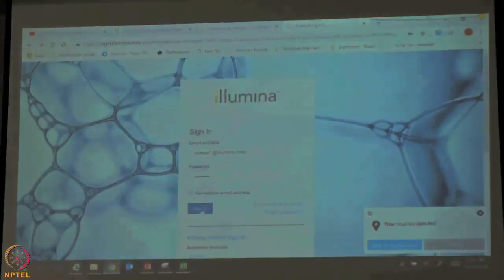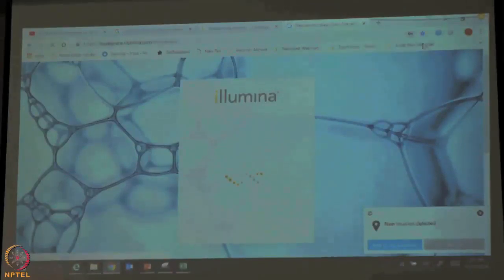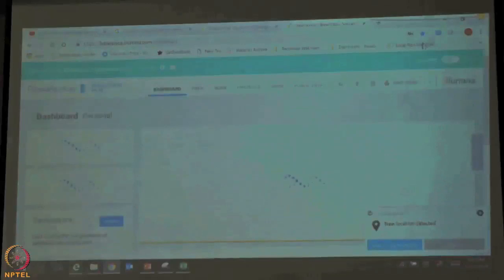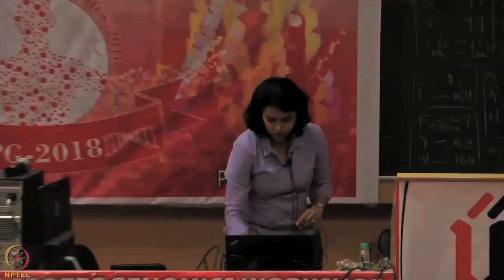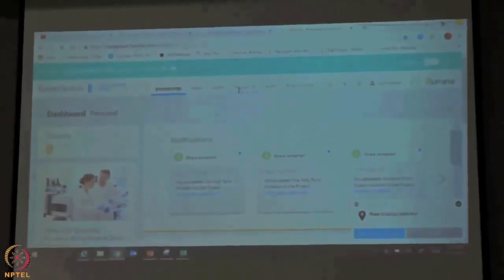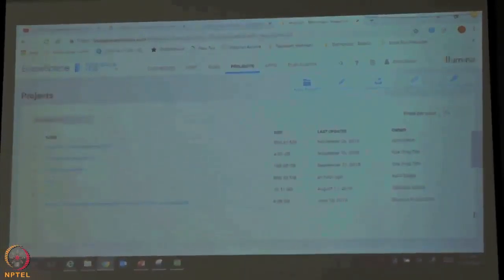What I want you to do is log in to your BaseSpace account and refer to the handout that was given to you. But before we actually start the hands-on session, I wanted to show one very interesting property of the Illumina data — something that Mukesh also touched upon during his presentation — that is the quality score, and the very high quality data that is generated on the Illumina platform.